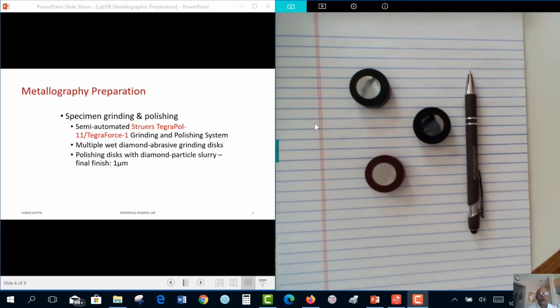Hi folks, these were long videos, but then indeed grinding and polishing takes quite a bit of time, and there are a lot of procedures involved. We have to take utmost care in terms of cleanliness, etc. Now that we have our polished discs, we etch them with 2% nitric acid so that different phases react differently to acid, and they appear therefore differently under a microscope.